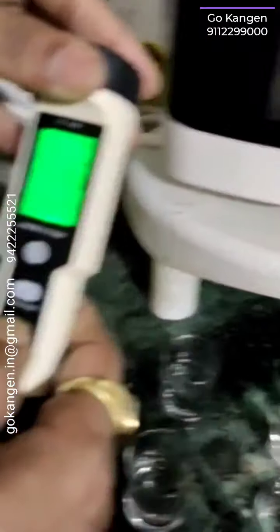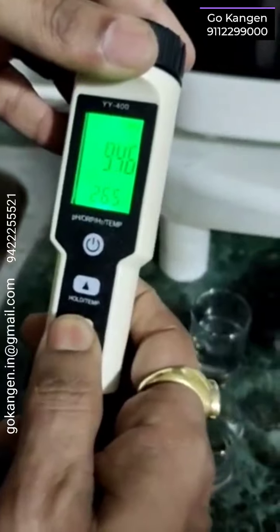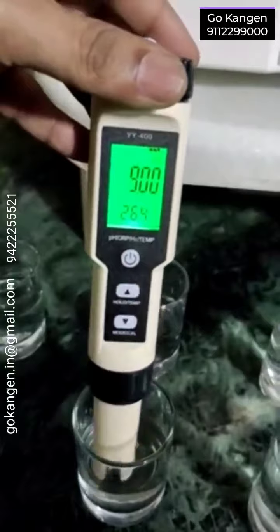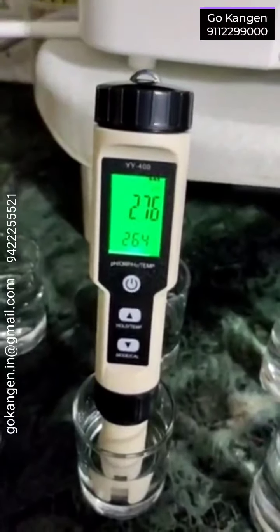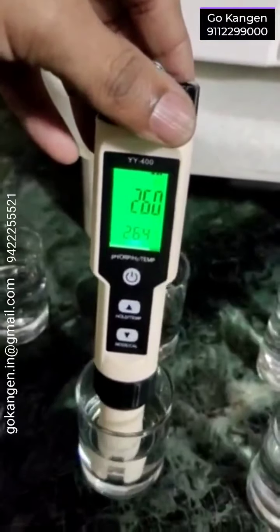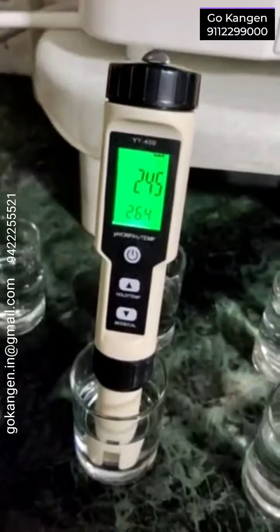Let's check for what we were waiting. Say pH — we can check. Let's check for 2.5. Very close. It is showing 2.45.